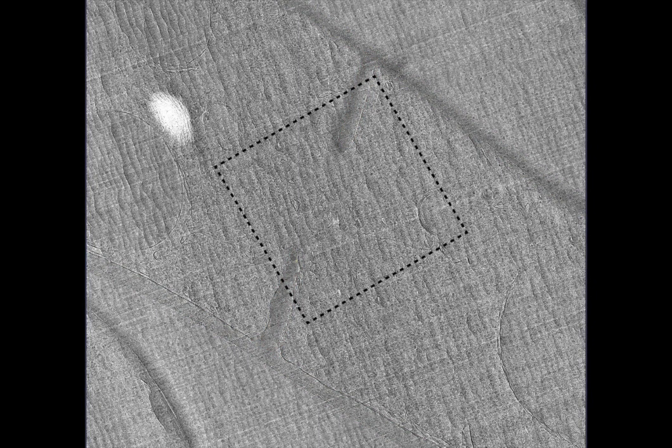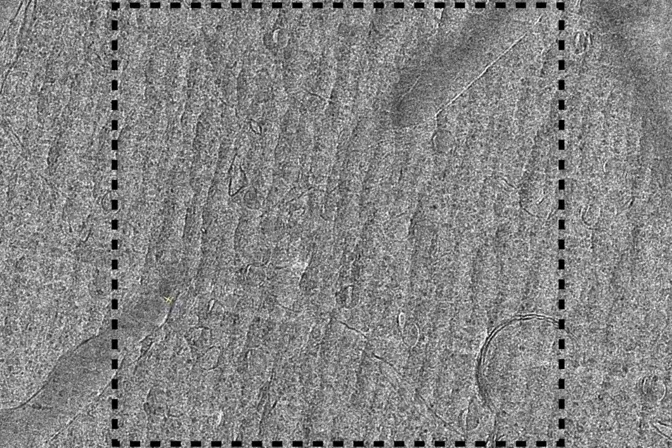In this intermediate magnification image of a cryo-section through a dividing S. pombe cell, the cell wall and the ingressing septum are clearly visible. In such a case, the leading edges of the septum were targeted for higher magnification tilt series imaging.